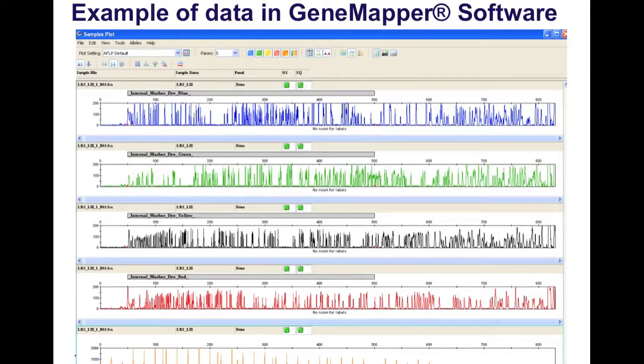Here is an example when you explore sequencing traces in GeneMapper software. It allows you to separate these traces into individual components. Here in blue you see all the peaks for guanosine nucleotides, the G peaks. Shown here in green are the A peaks for the A nucleotide, here in black are the T traces, and here in red are the C traces. Shown here is the internal size standard, in this case we use the LIZ-600 size standard.